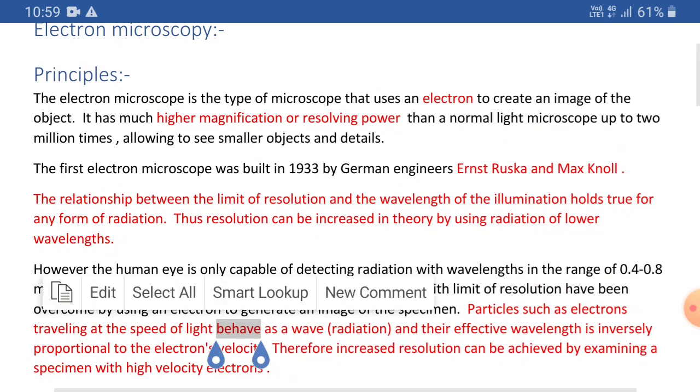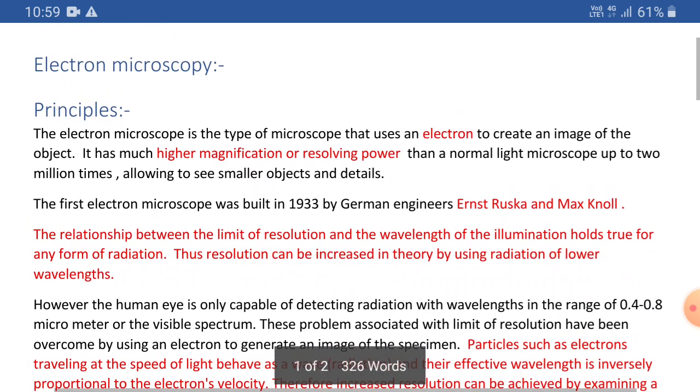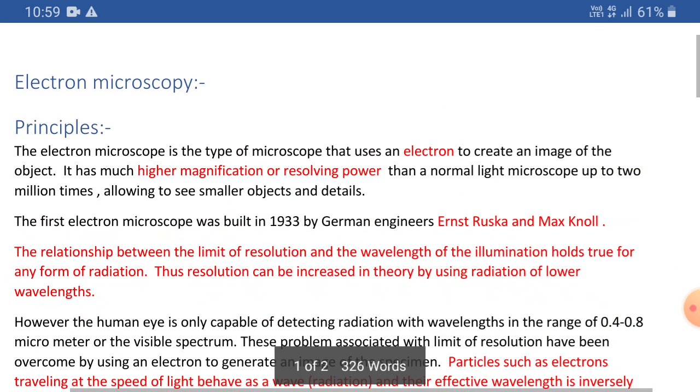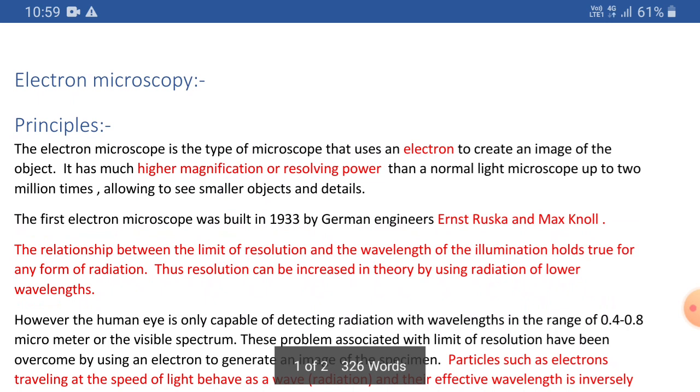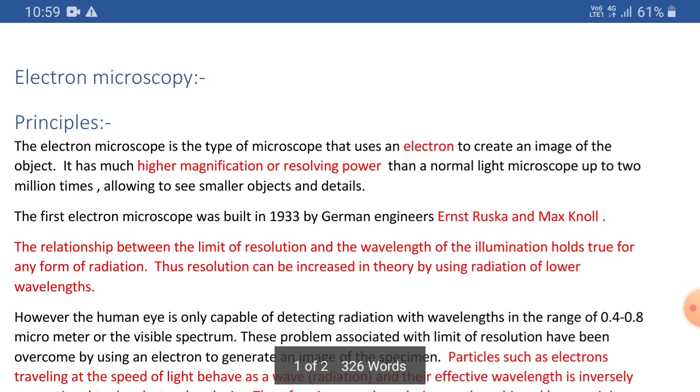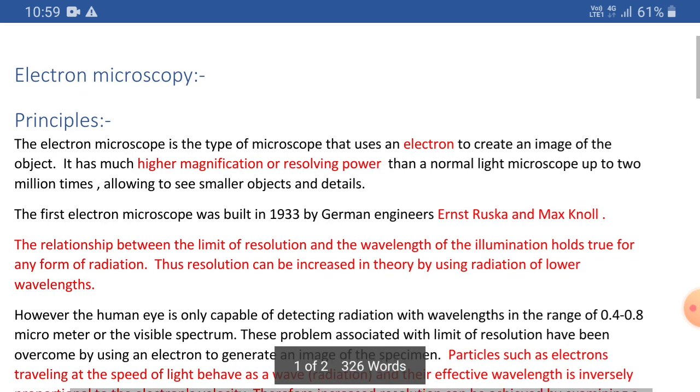Now there is another problem that we faced. This phase contrast microscopy clearly solved every kind of problem that we faced during dark field microscopy or light field microscopy, because here we can visualize live cells, no doubt about this. And although artifacts are still present in the system, the higher resolution now allows us to distinguish which one is our artifact and which one is our sample.